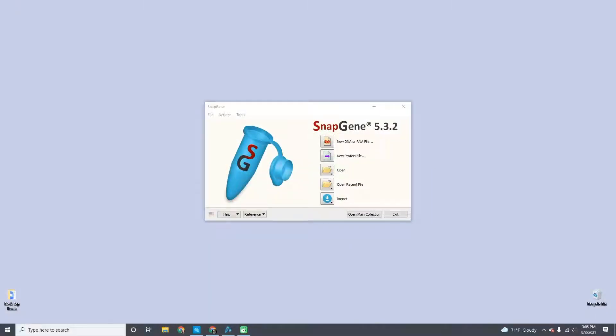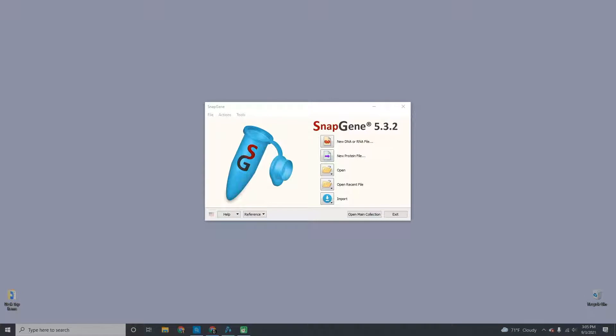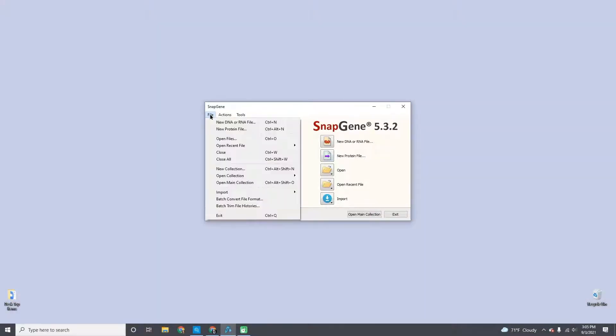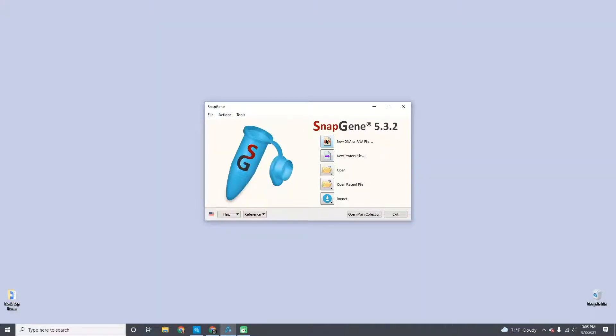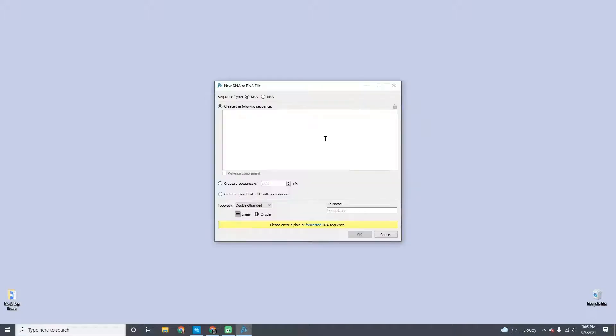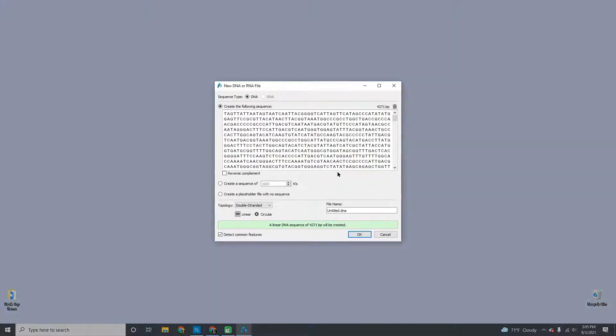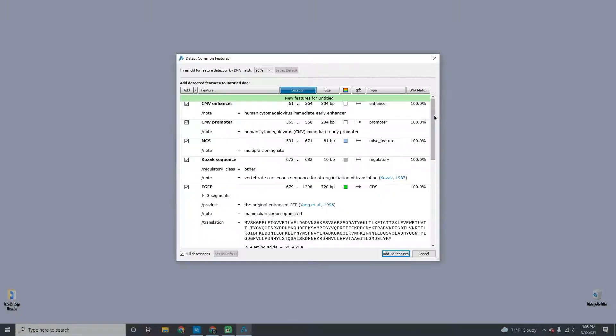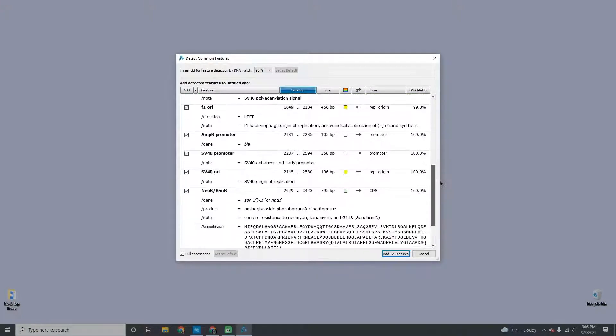You can create a new DNA or RNA file directly from the launch window either from the file menu or by using the new DNA file button. Just type or paste your sequence into the text field. SnapGene will detect common features and allow you to add them.